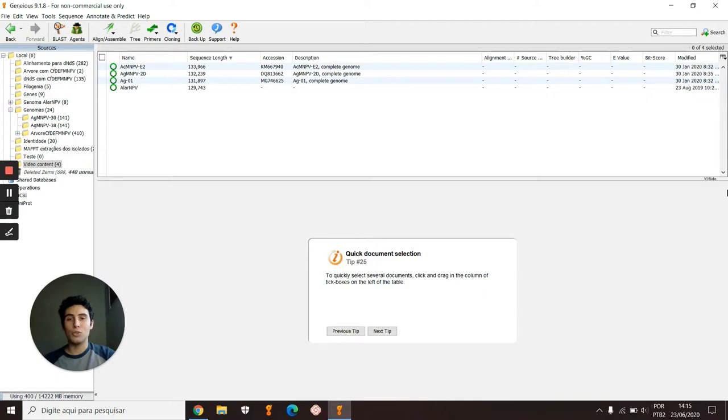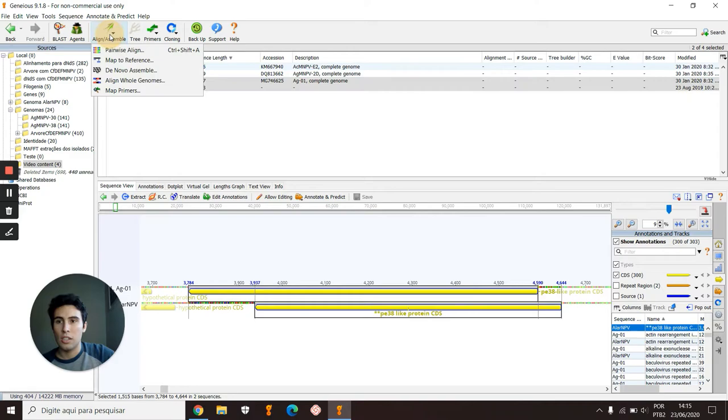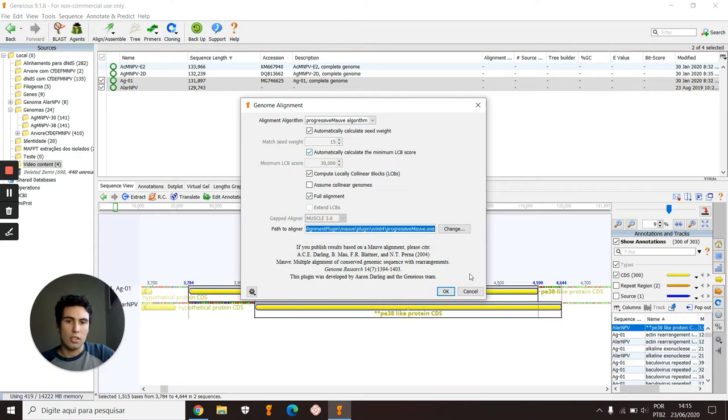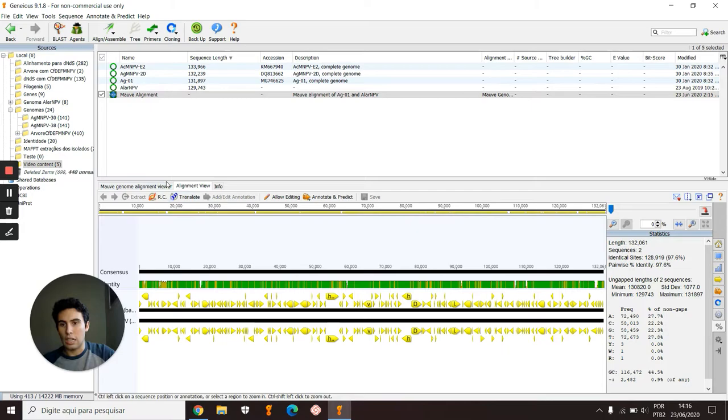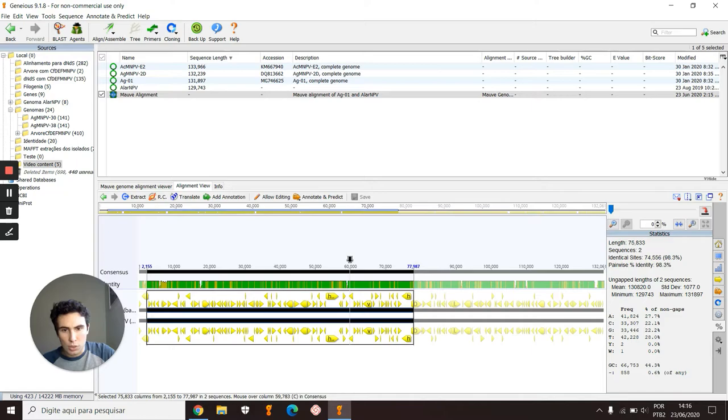And you can also align whole genomes. For example, if I align this isolate with this one, I will go here in Align Whole Genomes, in Align and Assemble, with these default options. And here we have the alignment view. This just compares these whole genomes.